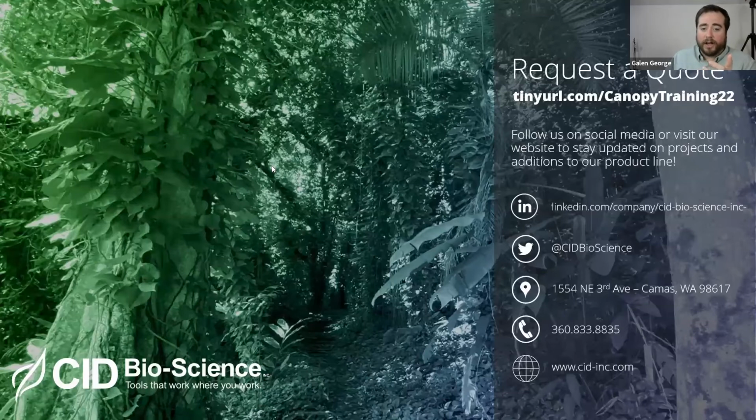And you can always also type in manually, as I mentioned, the zenith angle of the sun for the LAI calculation, if you don't think you can rely on the GPS on the instrument. However, it is a very, very precise GPS system within the device, so I don't think you should have that issue. It definitely is not bad enough to be miles away from the true point, so you should be fine.